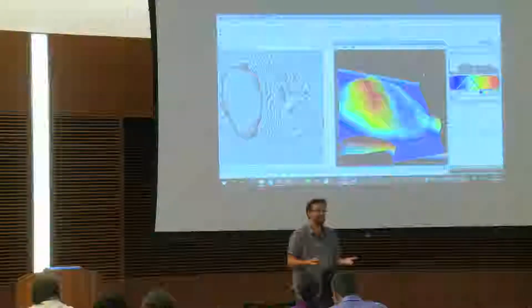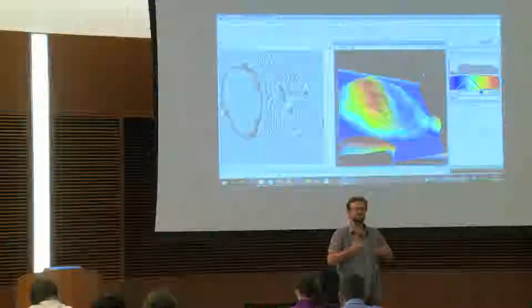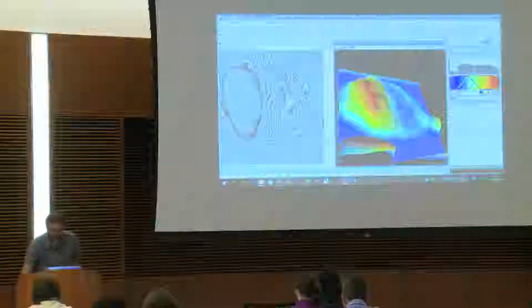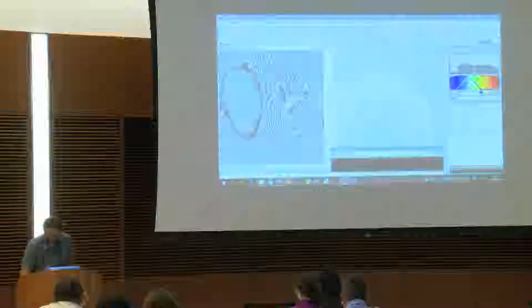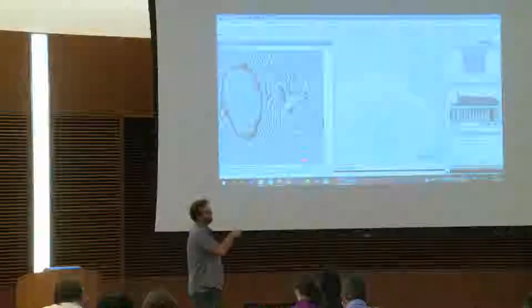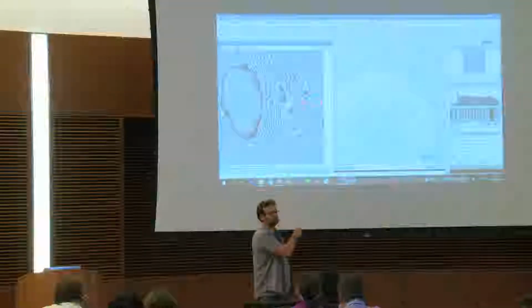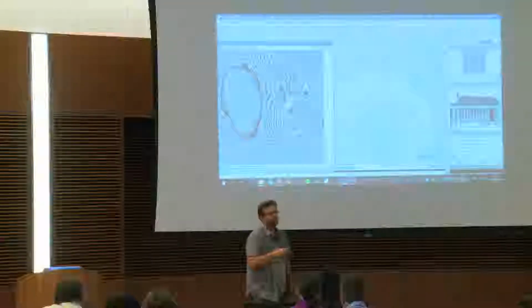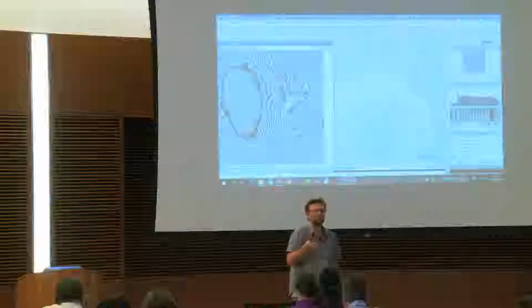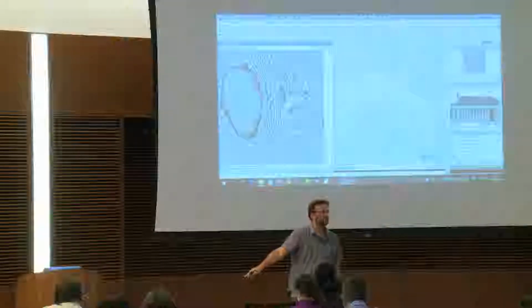Okay, so usually when you go to 3D, you really believe that you apprehend everything and that you can really answer all the questions. Oh, by the way, I forgot to ask you another question, so I will hide it a little bit. You see all those things that you have here, all those stripes. Do you believe that they propagate into the sample? Because here I don't see it, okay? But do you believe that they are into the sample too? And if you provide the proper answer, you will have the answer to, in an image, is the noise only in the background or everywhere?